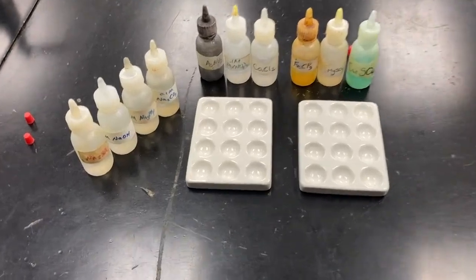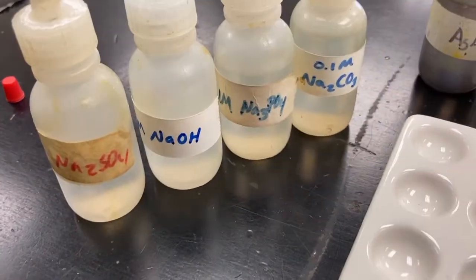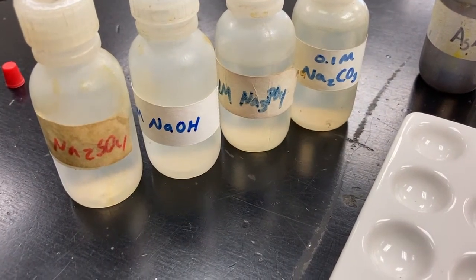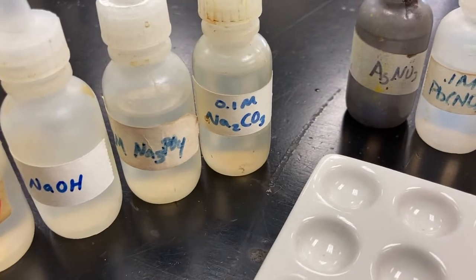procedure would be like. Okay, so what I have set up here is I have 4 sodium-based chemicals on the left-hand side: sodium sulfate, sodium hydroxide, sodium phosphate, and sodium carbonate.